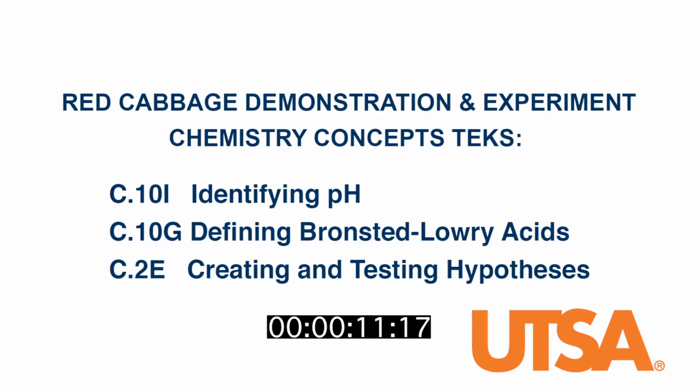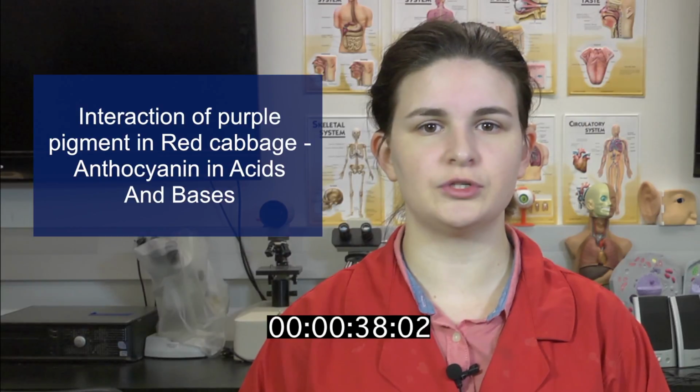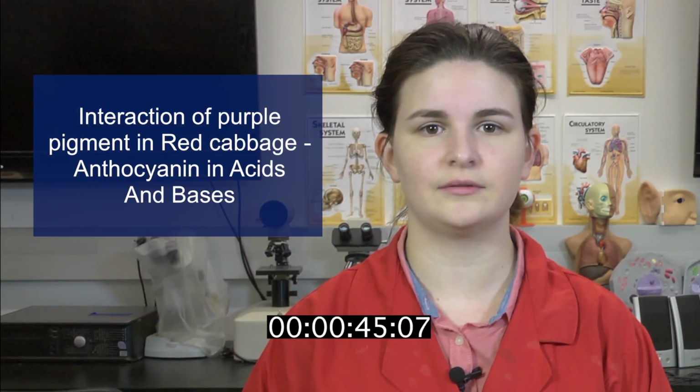Today, I'll be demonstrating the use of an indicator in identifying acids and bases through the Red Cabbage demonstration and experiment. We will observe the following concepts related to the chemistry TEKS: C10I on identifying pH, C10G on defining Bronsted-Lowry acids, and C2E on creating and testing hypotheses in the lab. The reaction we'll be observing in this demonstration is the interaction between a naturally occurring purple pigment in red cabbage called anthocyanin in the presence of acids and bases.